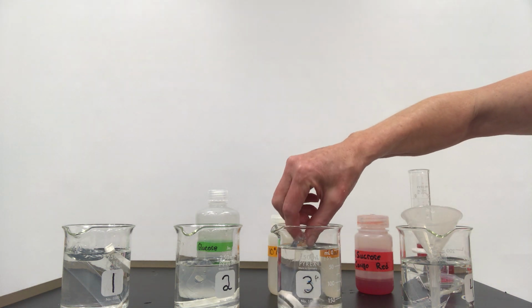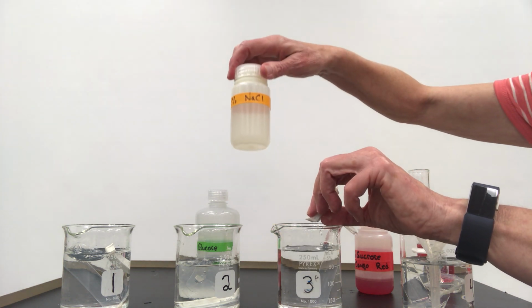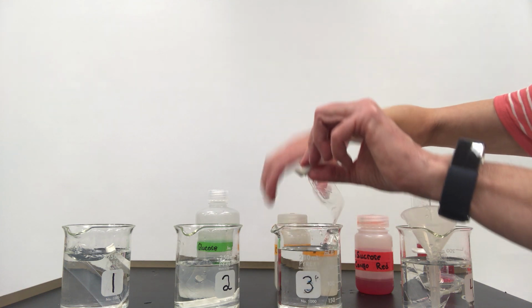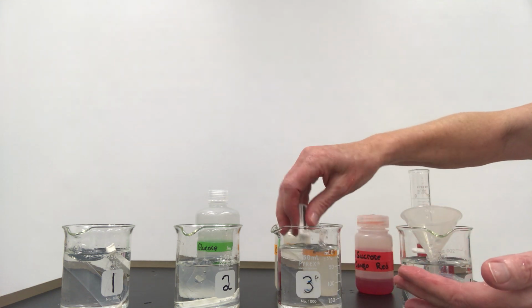The third beaker we have filled with distilled water, and in the sac we have filled it with a sodium chloride solution. This is a salt solution, 10% sodium chloride. This is also going to be a hypotonic solution relative to the sac.